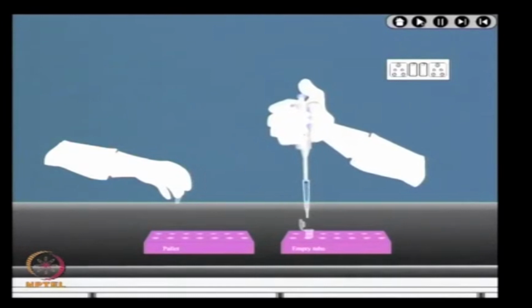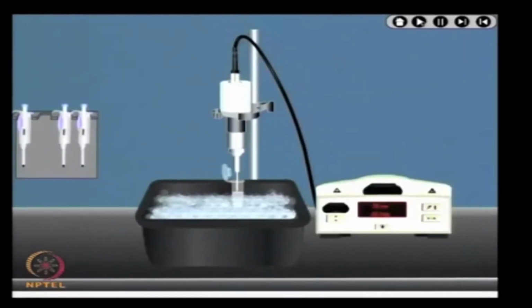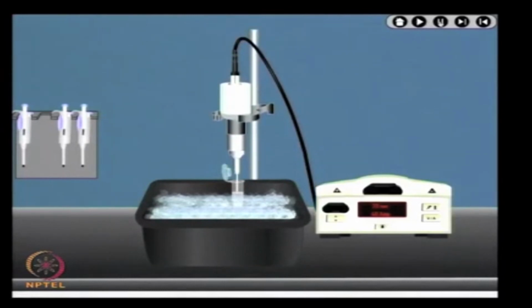Wash the bacterial pellet with phosphate buffer of pH 7.4 for 4 times to remove the media. Resuspend the pellet with protease inhibitors and lysozyme, and the cells can be further ruptured by sonication on ice to prevent foaming and heat. The sonication step helps to release the contents of the bacterial cells.